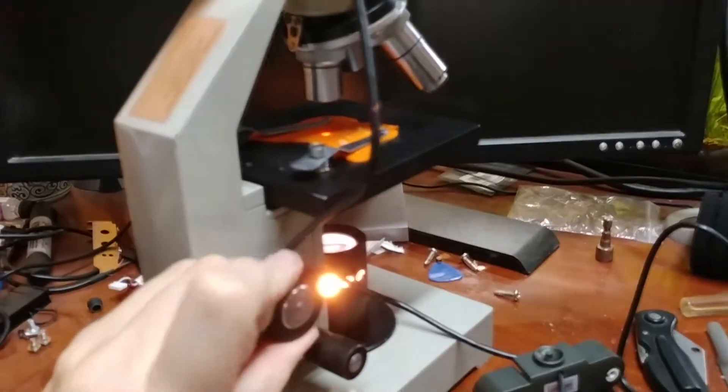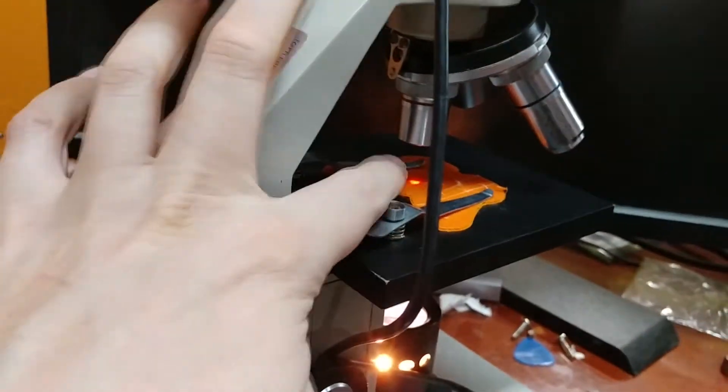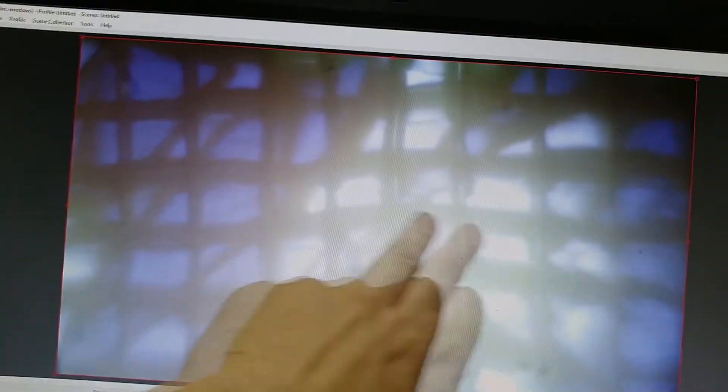With that in place, I can now use the adjuster knob and get a good focused picture. This doesn't look great because it's going through what's essentially opaque plastic, so this is just really to illustrate the size. If you notice, this is about 10 squares across — that's the size that we're dealing with.